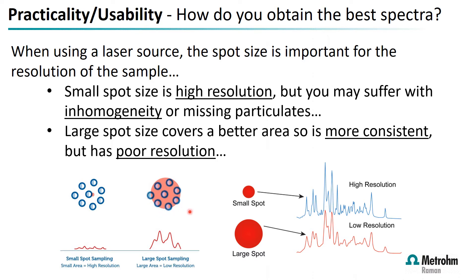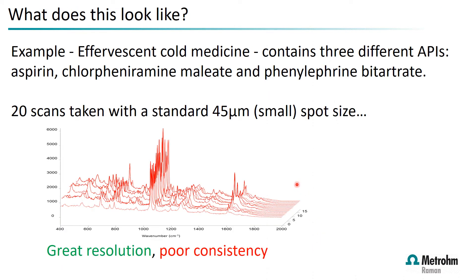A larger spot size covers a bigger area and is more representative of the sample, but can lead to poorer resolution in the final spectra. As an example, this effervescent cold medicine contains three different APIs. Taking 20 scans using a fixed laser spot size across an entire bag: the resolution is good and most peaks are in the same location, but the consistency is not ideal using this fixed laser.